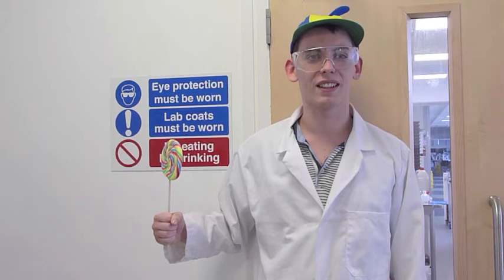Okay, and now the final rule is that I'm sorry, Johnny, but there's no eating or drinking in labs. Oh, man! Okay, and now you're good to go.